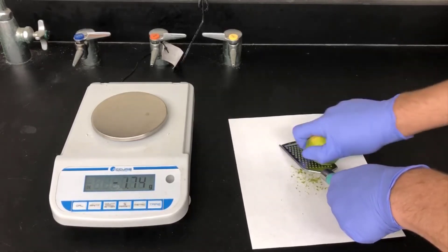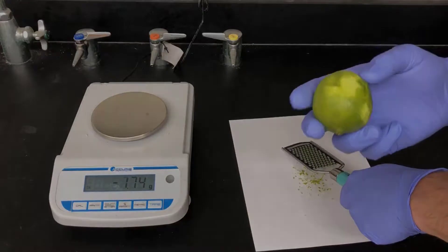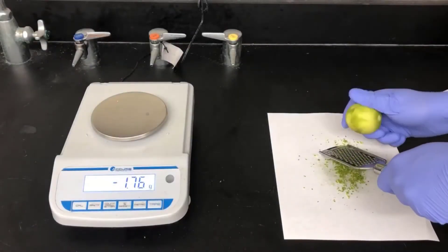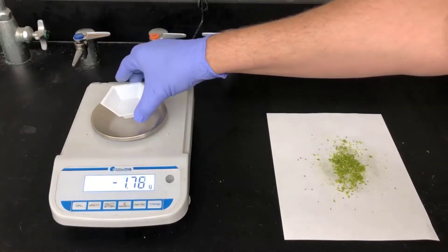I'm grating the lime onto a piece of paper here and that's just a convenient way to catch it. Now I have a pretty good amount of lime zest. I'm going to weigh it out and see how much I have.